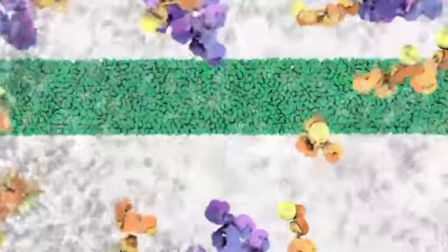Stripping the membrane of bound antibodies is accomplished by incubating the membrane with stripping buffer containing SDS and beta-mercaptoethanol under high temperatures. In the lab, stripping cannot be done more than 2 or 3 times before you begin to also strip proteins bound to the membrane, resulting in loss of signal.